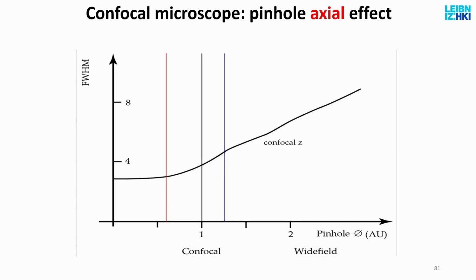And that's how Apotome works. It uses a pattern illumination, usually a grid, and this grid is moved across the sample and also sometimes rotated. So I get 6, 12, whatever images, which are all patterned, but from that, with very simple mathematics, we can calculate the high resolution. So this is a cheap confocal-like system. And that's for the Apotome.